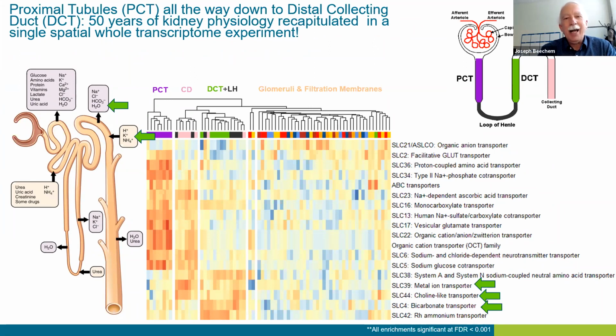So you can see it's sort of like one experiment on a healthy organ like this. I'm just walking myself spatially with whole transcriptomes through the biology of how that organ functions. And I'm basically reading off, as far as I can tell, about 50 years' worth of kidney physiology recapitulated. Those are all individual studies, crazy, dissecting organs and ion channel recordings and all these other things. You're getting about 50 years of kidney physiology recapitulated in a single set of whole transcriptomes on this particular tissue.